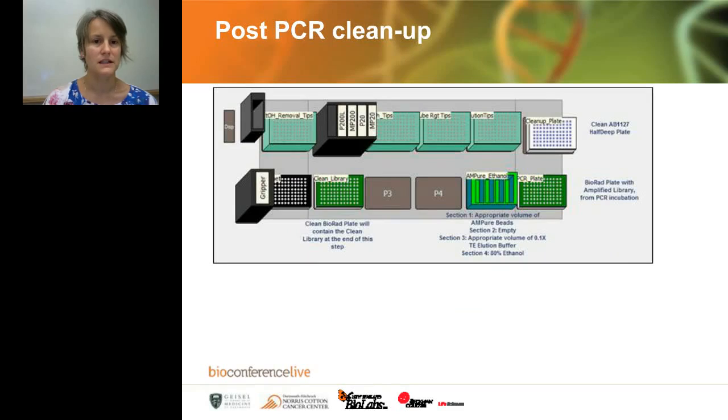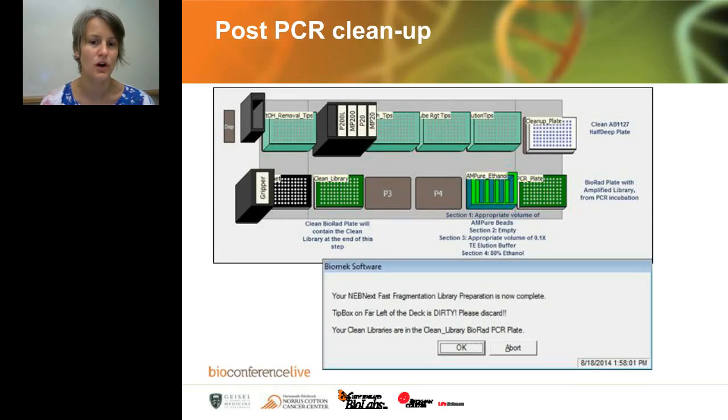There is a second cleanup step after the PCR. Again, we're using the same setup as before, where we're using the AMPure XP beads and the magnet. And once our protocol is complete, there's the music, of course, and then a note that tells us we've completed the protocol. It is also telling us that there are dirty tips, and to make sure you discard the dirty tips. And then these libraries are ready for QC and sequencing.